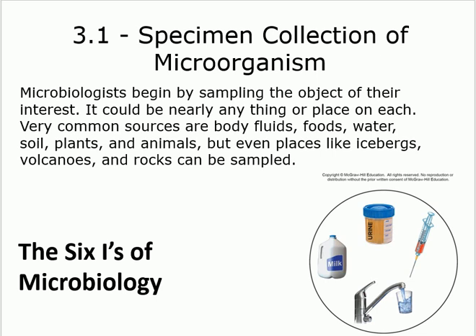You can get it even not from fluids, you can get a sample from the water, you can get it from animals, plants, volcanoes, you can get a sample from anything. And you're going to study it. But the way to get that sample, there are special tools that can be used for that purpose. And you will see these tools.